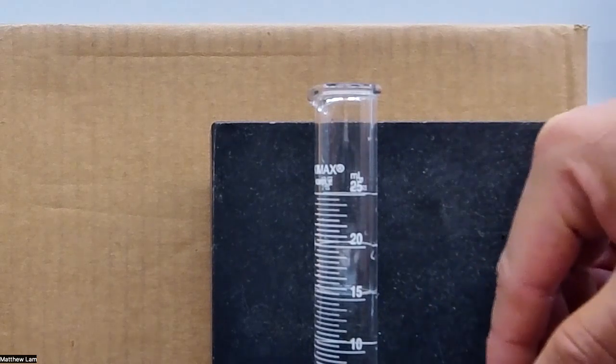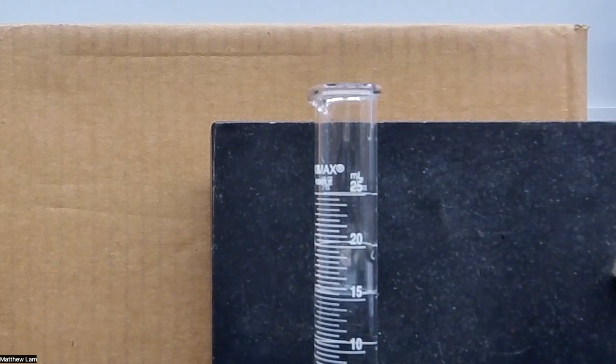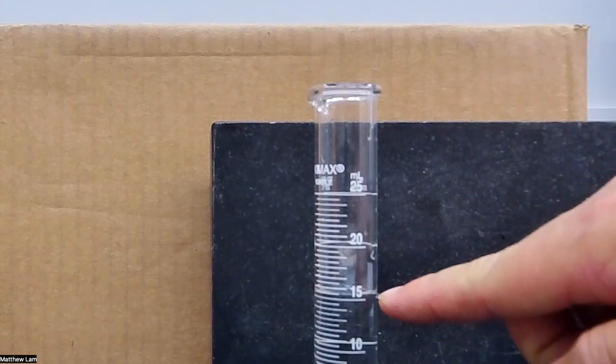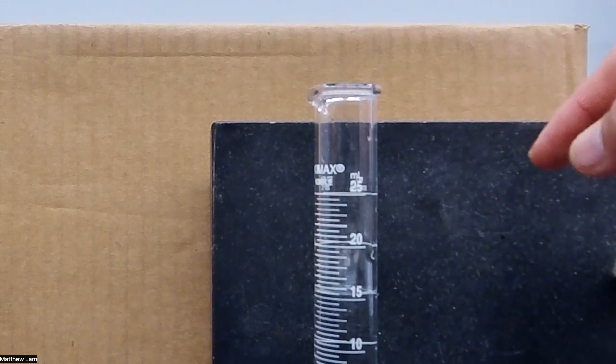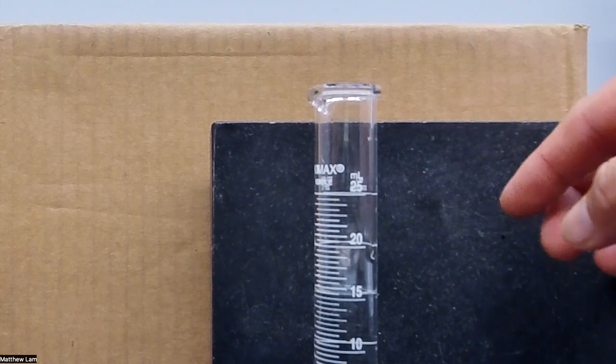And so if we read this, remember when reading a graduated cylinder, you want to read under the meniscus, and the meniscus is that curve at the top of the layer. You don't want to read the middle or the top. You want to read at the bottom of the curve.